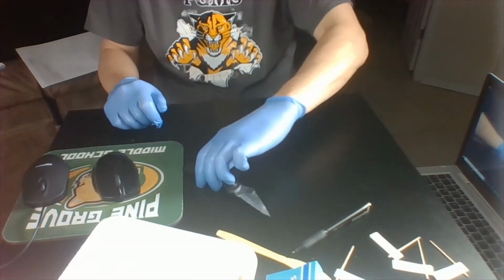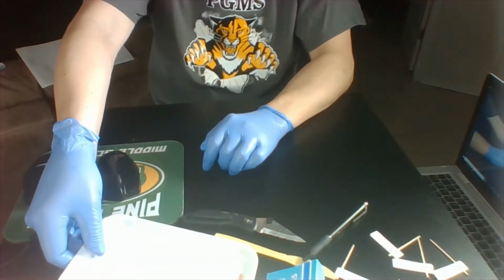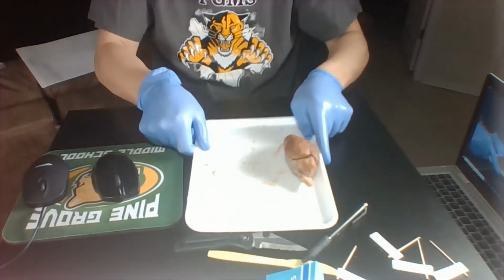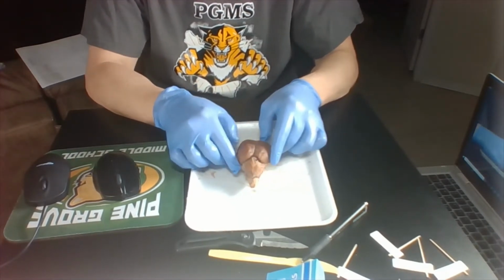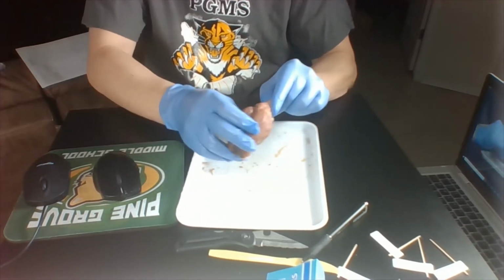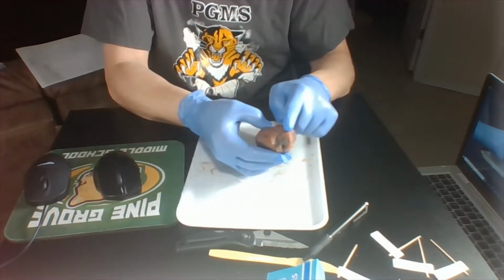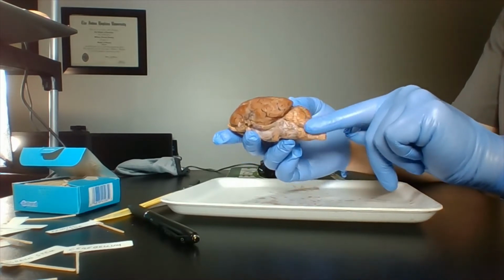Okay, so before we cut anything, we want to identify some parts of the brain. I'm going to take my brain here on the tray. And the first three things we're going to identify on here are the brainstem, which is down here. I'm going to try to show it on two different camera angles. So this is the brainstem.